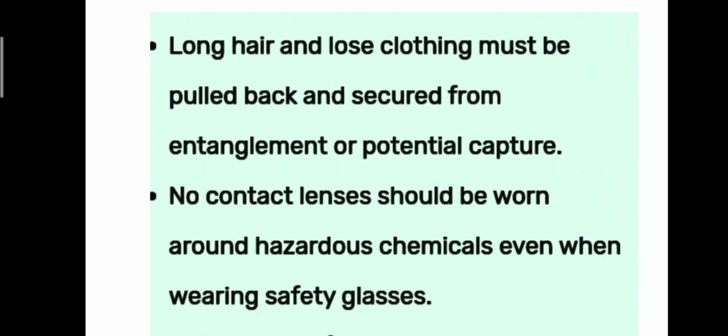Long hair and loose clothing must be pulled back and secured from entanglement or potential capture. No contact lenses should be worn around hazardous chemicals, even when wearing safety glasses.